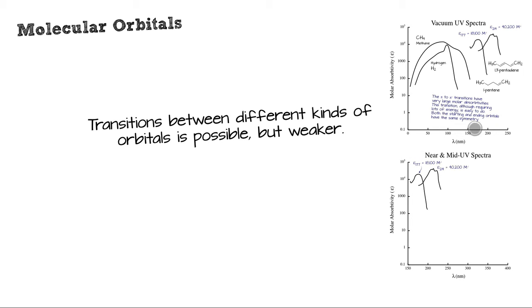So here I'm looking at the higher part of the spectrum. We're looking at these two right here, and I've placed them here. There's our pentene, there's our conjugated pentadiene. Those are easy, and look at the absorption coefficients. 18,000, really high absorption coefficient here. Here it's 40,000. That's a logarithmic scale here. Every one of these notches is tenfold greater absorbance.